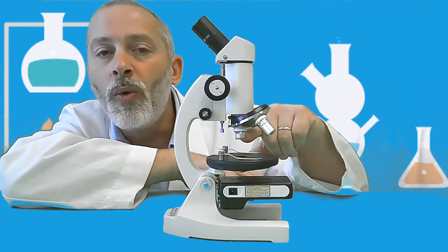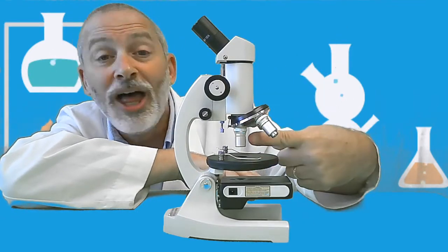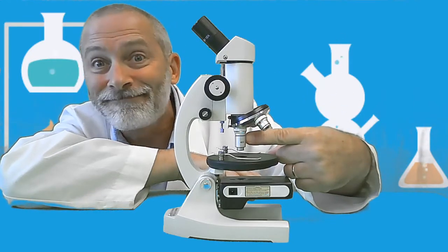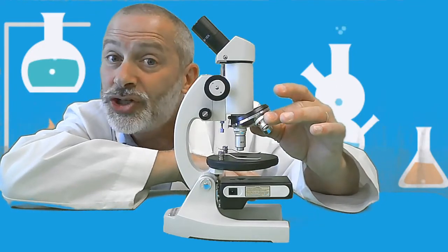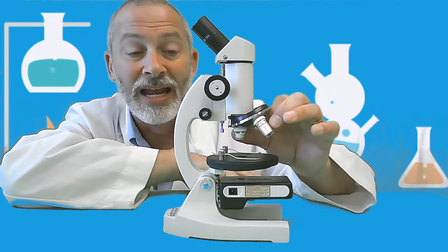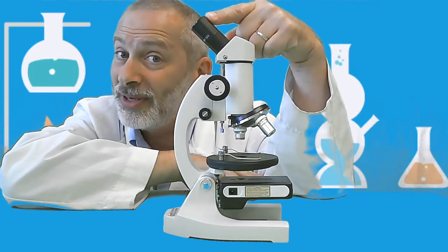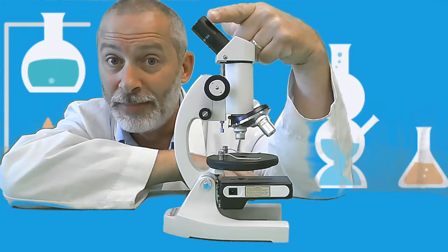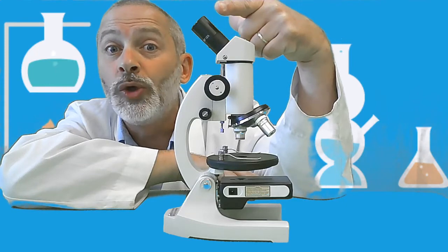The really small one is called the low power. The next one is the medium power. And what do you think this one is called? High power magnification. Now, each of them have a number on them as well. And if you look at the number and you multiply it by the eyepiece lens, so it's objective lens multiplied by the eyepiece lens, you get the total magnification of what you are looking at.